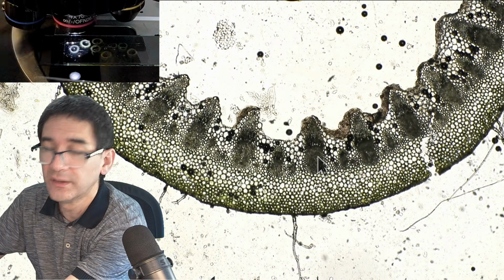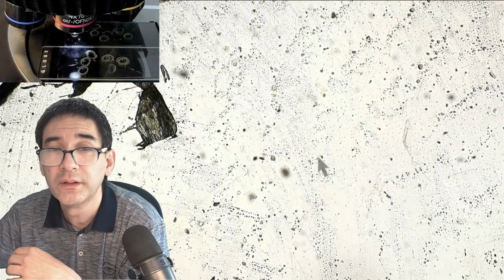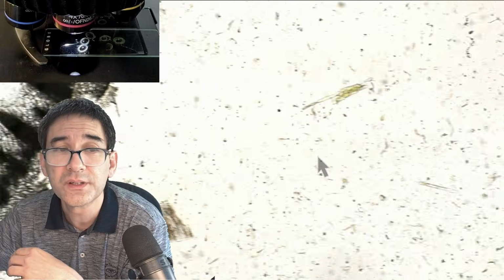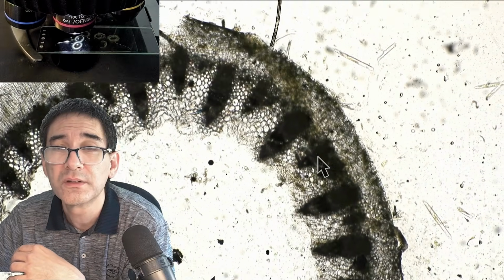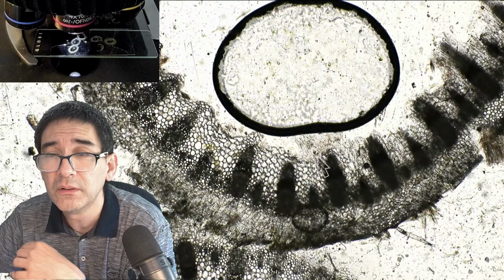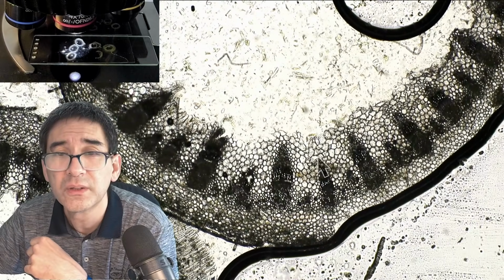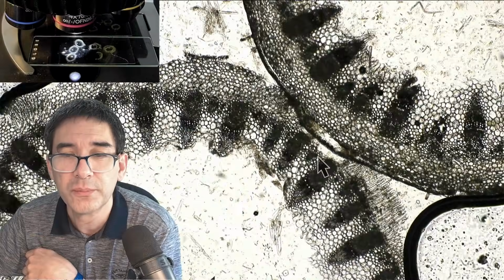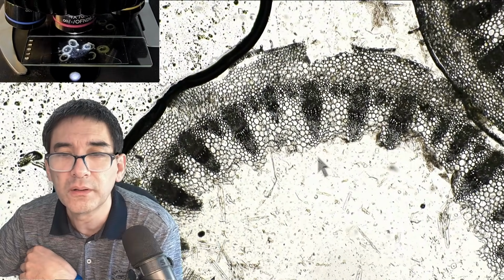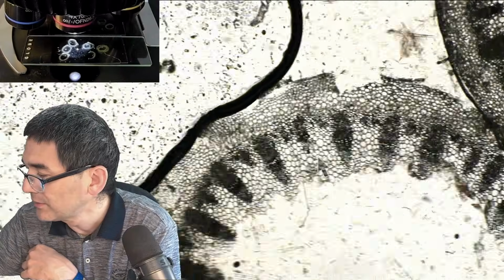So this one is still the one from before. And where is this? Ah, yeah, that's the one from right now. It's not a very nice one. This one here is also not so nice looking. Let's have a look here in this one. There are lots of stuff floating around, lots of debris. But look, overall, some of the cross sections do look a little bit thinner.